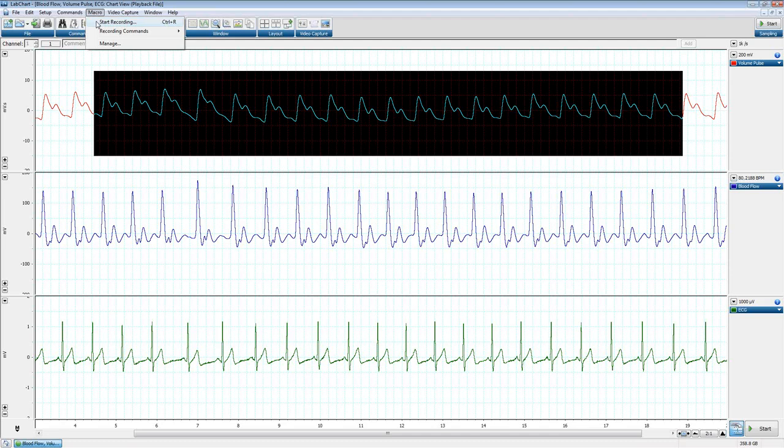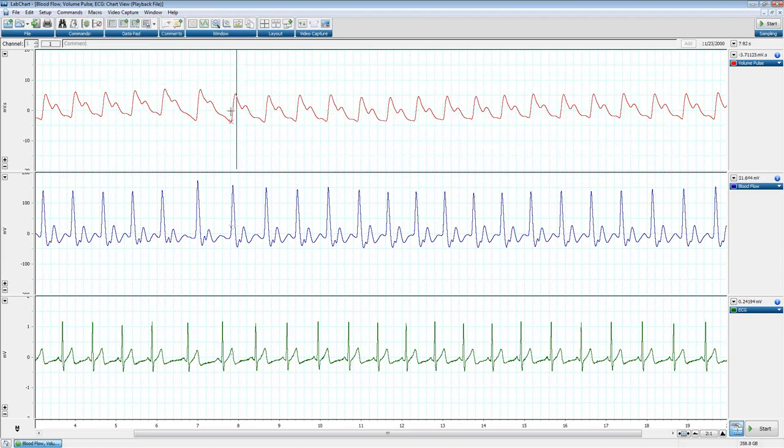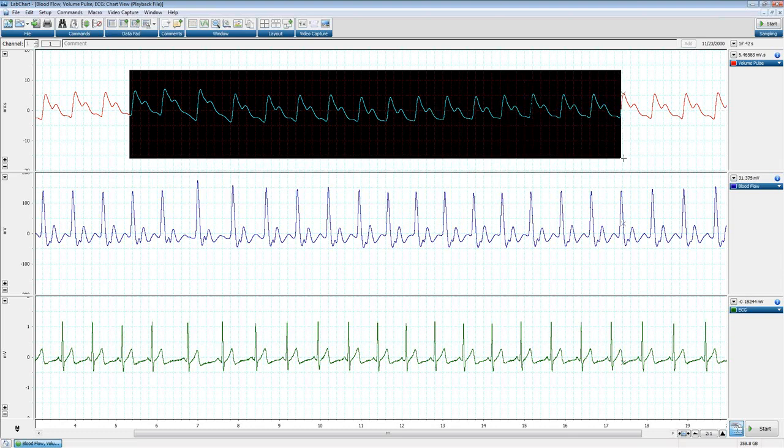And the reason I say that is because people get a little click happy, and they'll simply just click in the window, and that'll be recorded as part of their macro. So when we're doing this type of macro recording, we have to be careful that we are very deliberate in what we do with our mouse clicks and things like that.